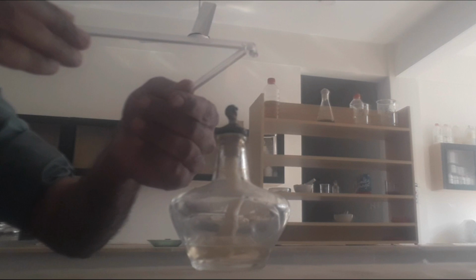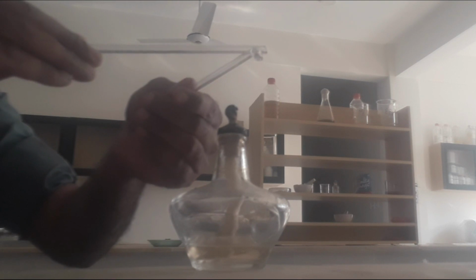All you need to get started is a glass rod and a reliable lab lamp. These everyday lab tools will be the key to creating your very own custom spreader. Steps. Here's the breakdown of the process.